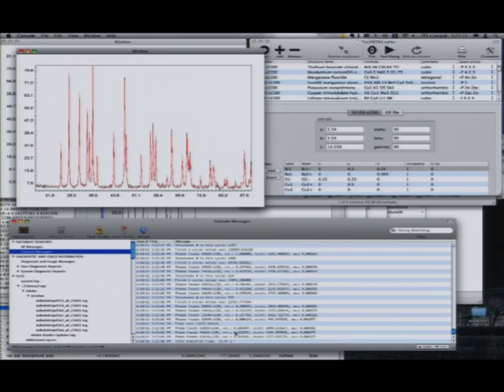Well, what I would like is to distribute it. The core of this one is the next MAUD. And since the ICDD is commercial, I don't know. That is the reason I can only demonstrate it up to now.